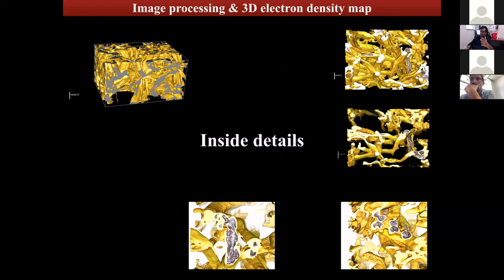Once you have a good idea, you do the reconstruction, you know what magnification you want to select. You put those parameters into the newer recipe and you collect the data set. And that will be all. From that point onwards, unless you want to do something different, you will be able to use that particular recipe to collect as much data as possible.